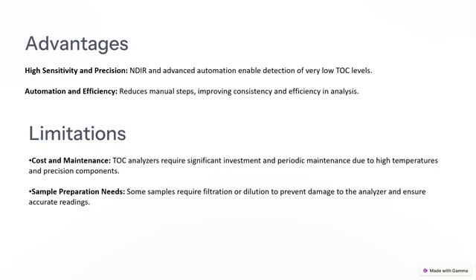In limitations, we have very high initial costs and maintenance requirements, and the sample pretreatment may sometimes require specific applications such as filtration for particulate-laden samples.